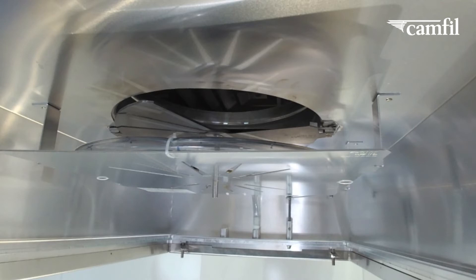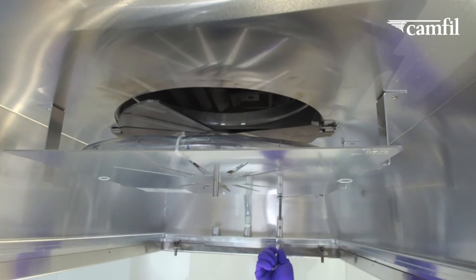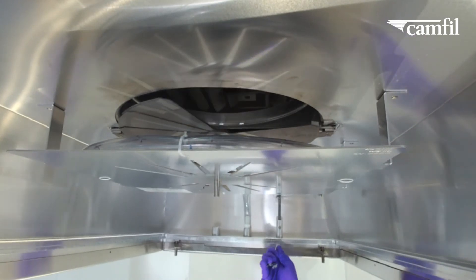The PharmaSlim housing features Tigon tubing and an aerosol distribution plate for test and certification. The damper adjustment on the room side also allows you to modify your Bowtie damper position.